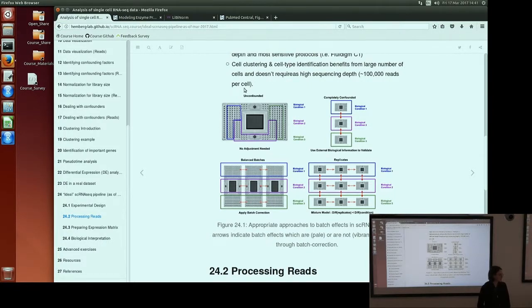If you're trying to achieve, say, 8,000 cells and that's enough for your entire experiment, if you can do it in one run on a 10x, that would count as that. But depending on what you're looking at, it may or may not be possible to do that.